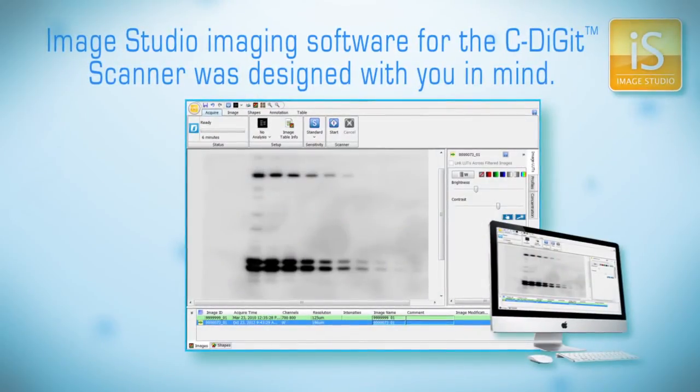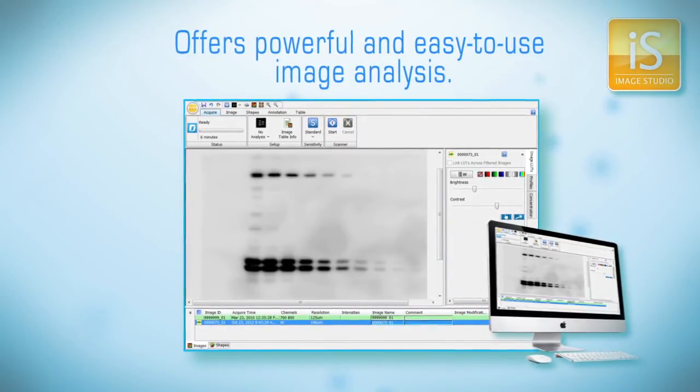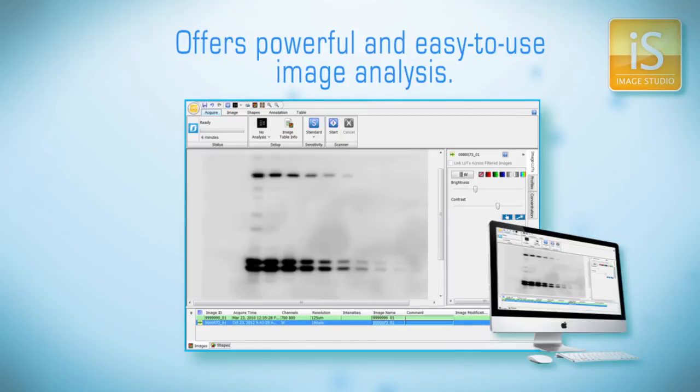Our friendly Image Studio imaging software for the C-Digit Scanner was designed with you in mind. It offers powerful, yet easy-to-use image analysis, while resolving issues caused by film's limited ability to quantify.